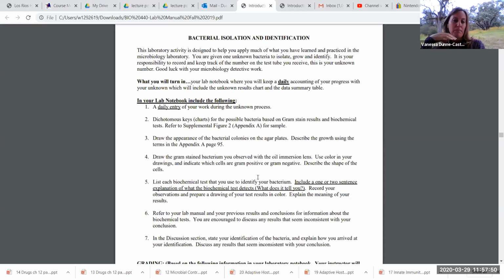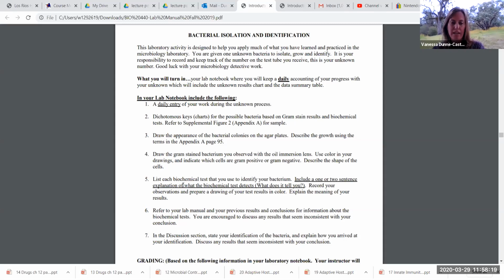The next thing would be moving straight into your dichotomous key, that first test that you have on the top there. So take all of the results that I provide for you in the PDF that I give you. And again, if you're doing electronically, copy and paste the picture associated with the test that you have in your dichotomous key and describe it. So you'll do that for each of these things, and then that would be number 5 here. For each of these tests or stains or whatever it is that you have on your key, essentially you're making little tiny notebook entries. So you should, for all of those, have a super brief purpose section.